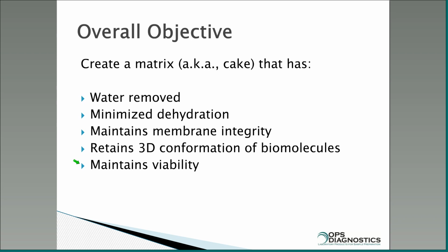Okay, but the overall objective when we do this is we're going to create a matrix, or what I like to call a cake, that has the water removed. You minimize dehydration damage. One of the things that can happen is any residual salts in your sample, as you pull the water out, can start to crystallize and pull water into the salts, and you can get localized membrane breakage due to localized high salt concentrations.